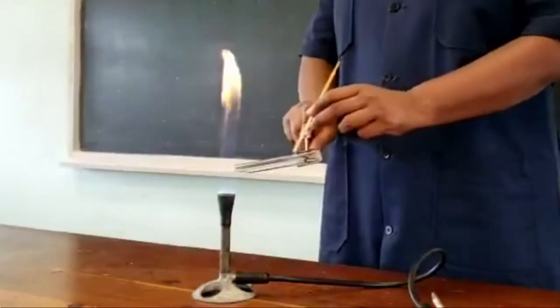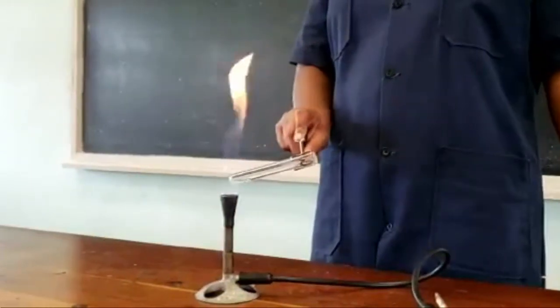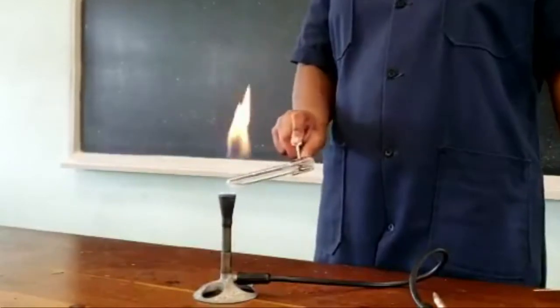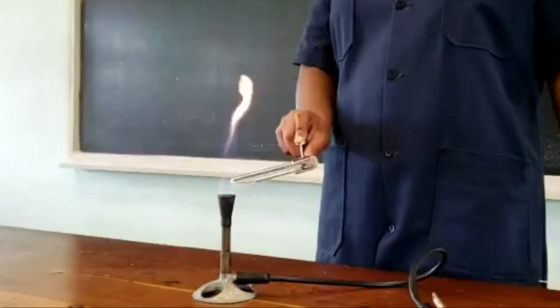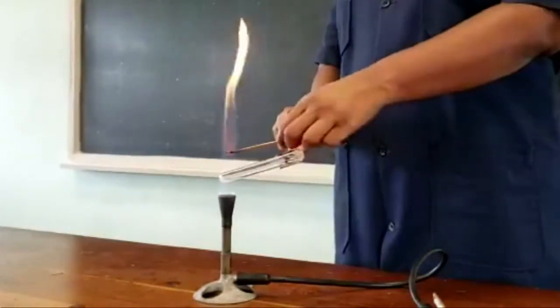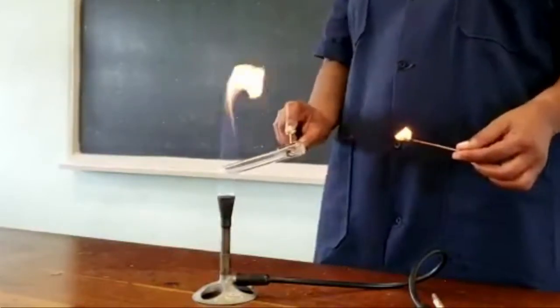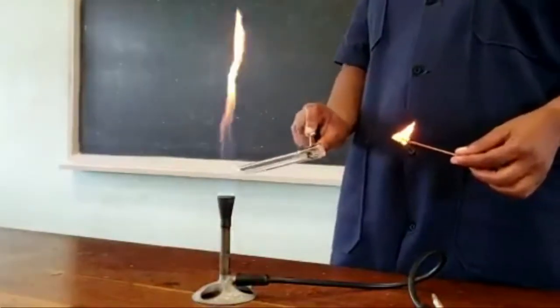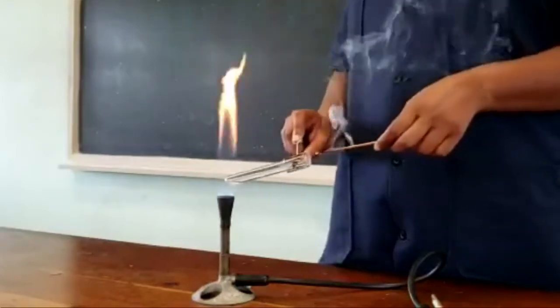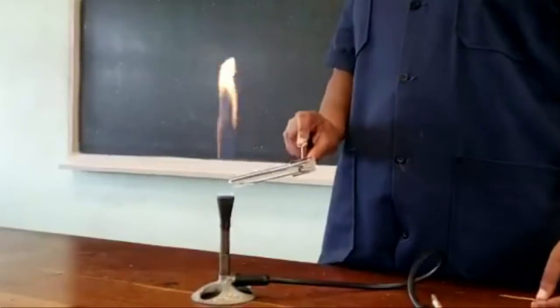So you can see the droplets are colorless liquid and we're heating it. Let's see if anything is happening. I'm going to test it, we're not seeing any brown gas, so I'm not going to use my litmus. I'm going to use my glowing splint and let's see what happens. Okay it's still not quite ready, we're going to heat it some more.